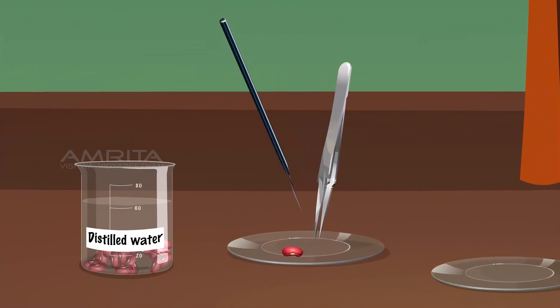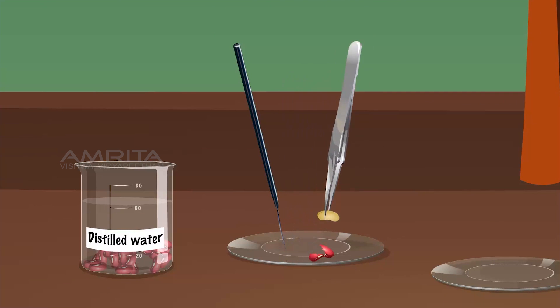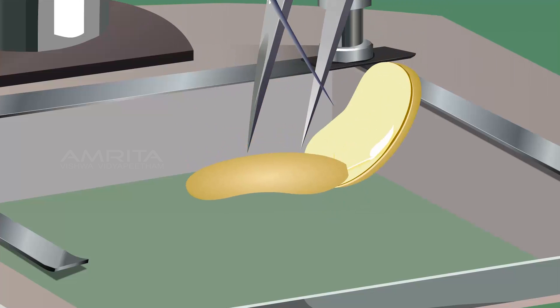Remove the seed coat of the bean seed using the forceps and needle. Using the forceps, pick up the seed and place it on the stage of the dissection microscope. Separate the two cotyledons of the seed using the forceps and needle. Observe the seed through the lens of the dissection microscope.